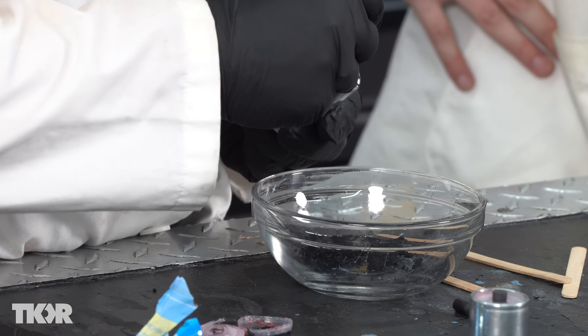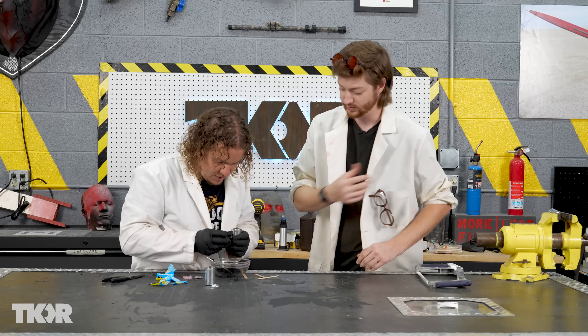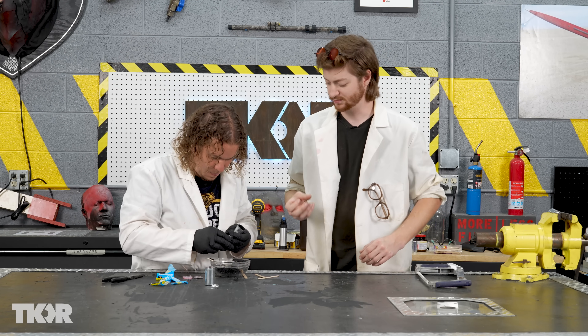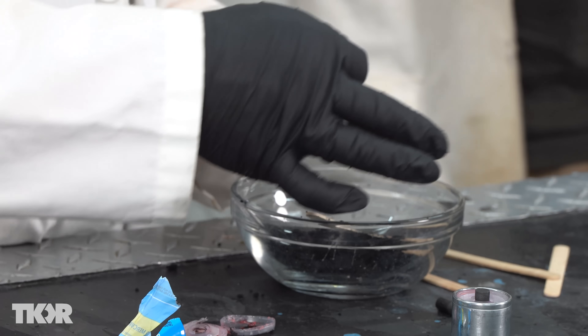It's a bunch of really dark black clumps — like a powder, but it's all clumped together. One warning: this stuff is almost like a pigment, it is super staining. It will stain everything.